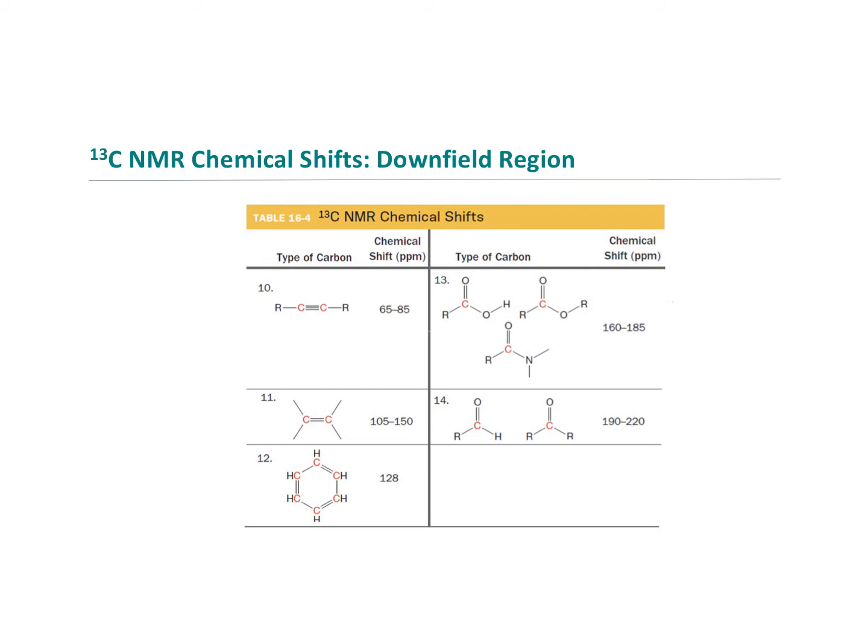We can see here our aryl groups, the carbons there, as well as the carbons for our aldehydes and ketones, which show up even further down. So these are going to mimic or space themselves in the same way as the proton NMR spectra.